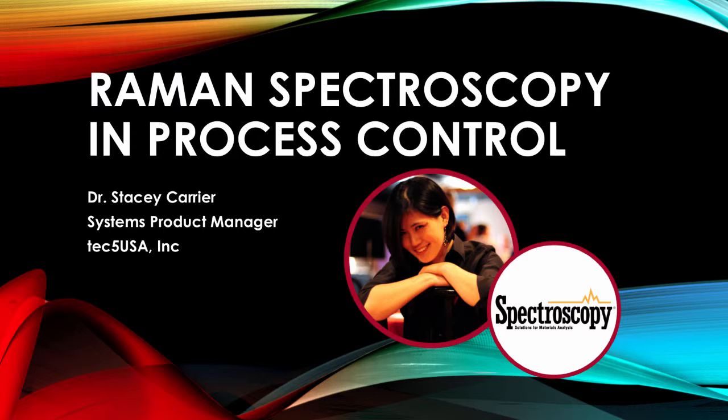The other problem with lasers is that they're expensive. After playing with lasers in university, I know how expensive some lasers can be. So in order to get a good, stable laser, it's going to cost a lot of money. However, the main reason that I see why Raman spectroscopy isn't huge in industry is that it is a very weak process.